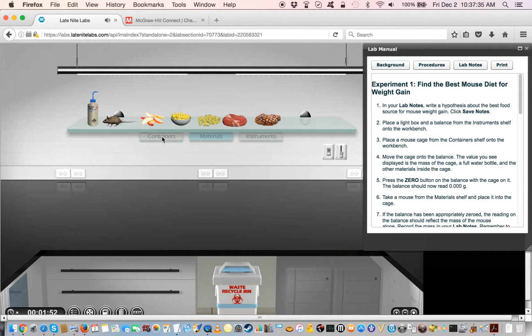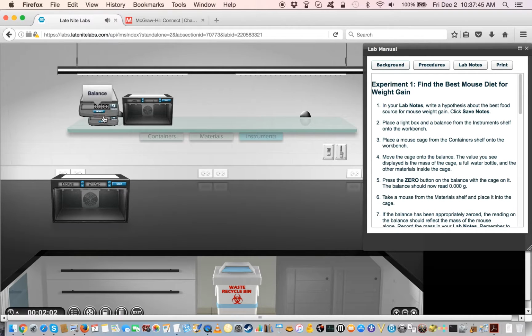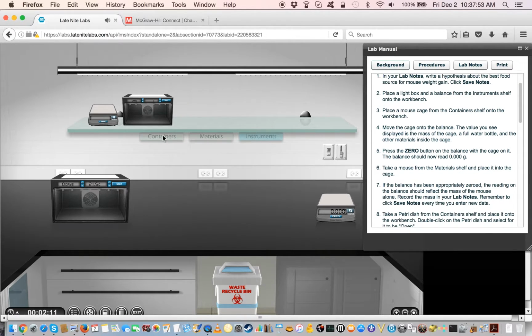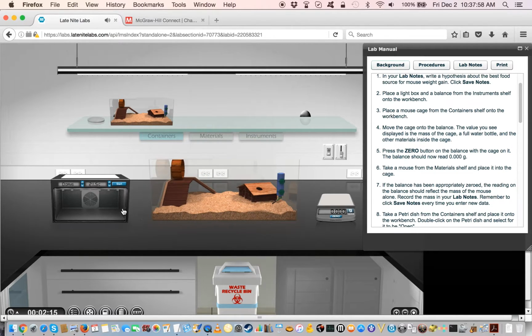Alright, so looking at the procedure, the first thing it asks you to do is get a light box and a balance from the instruments. So we'll put a light box down here, and the balance will go down here as well. I'll put it over here. The next thing we need is a mouse cage. We get that from the containers shelf. I'll stick it here. That's why I left a nice gap in between the balance and the light box, so I could put this cage in here as well.